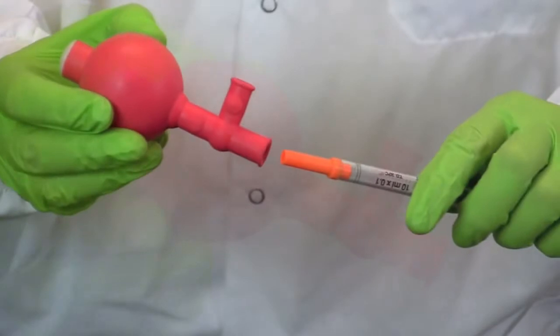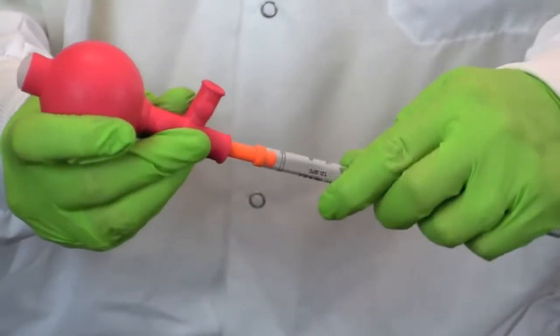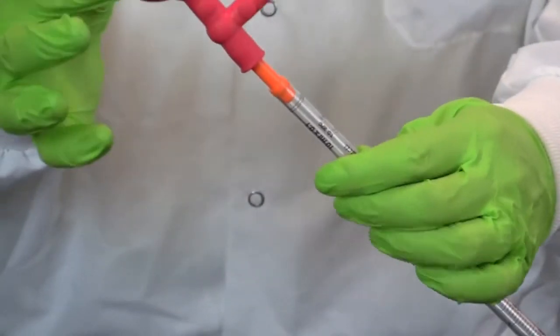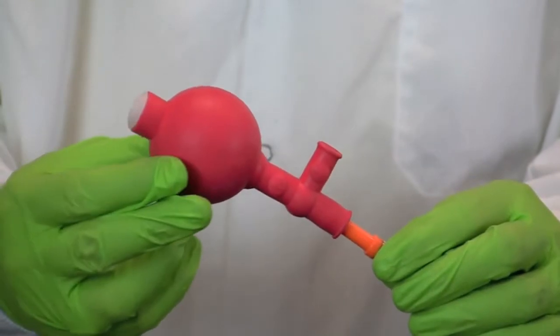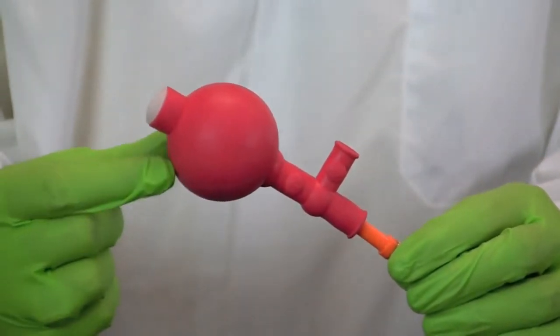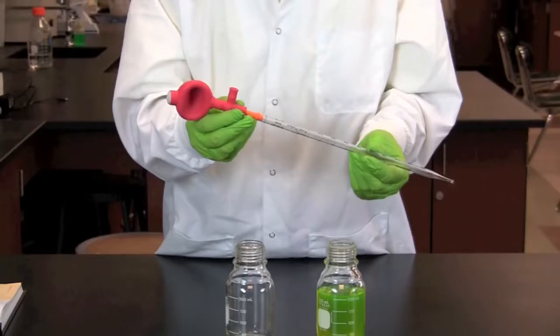To use a tri-valve pump, attach the pump to a serological pipette by twisting the top of the pipette into the bottom of the bulb. To fill the pipette, gently squeeze the bulb to release air through the one-way air valve.